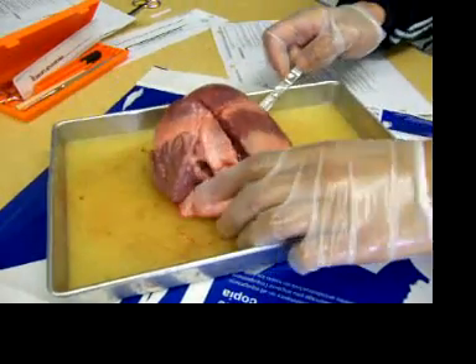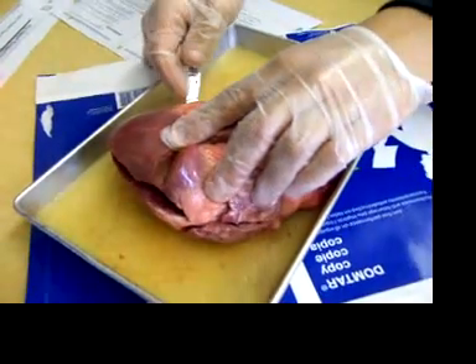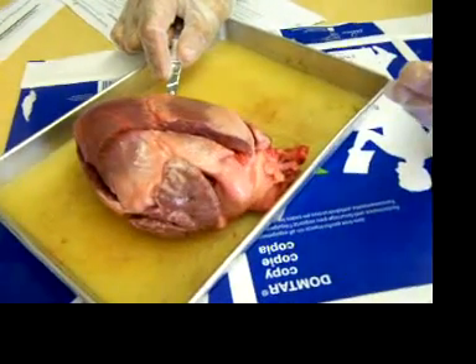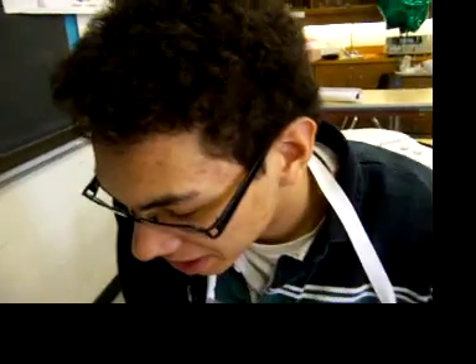You think we can peel it back now? Thank you. I'm cutting this side. Is this right? Why are you asking me? I've never dissected the heart fully. I've never dissected the heart in my life. I should know what to cut. Yeah, I can't see what it is.